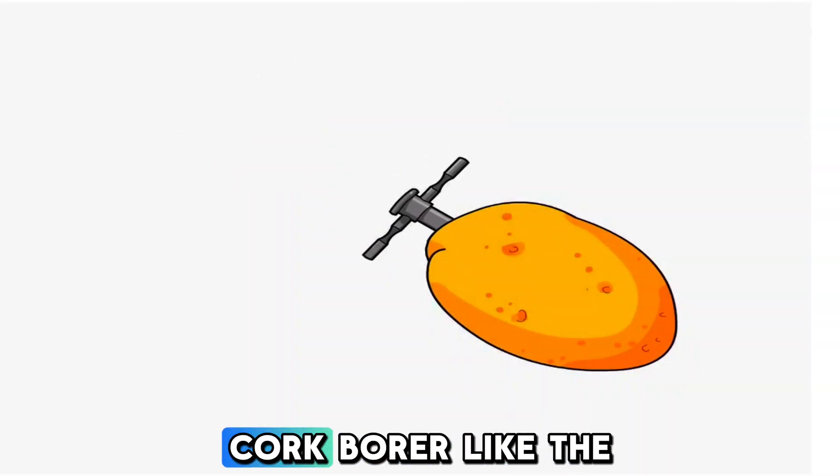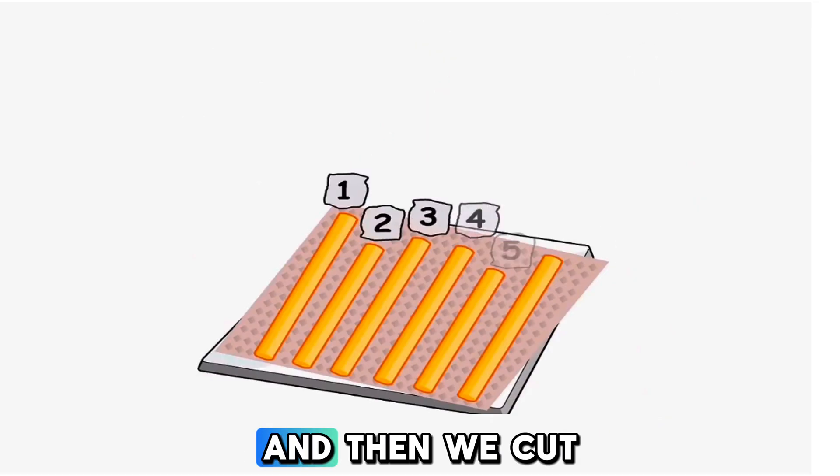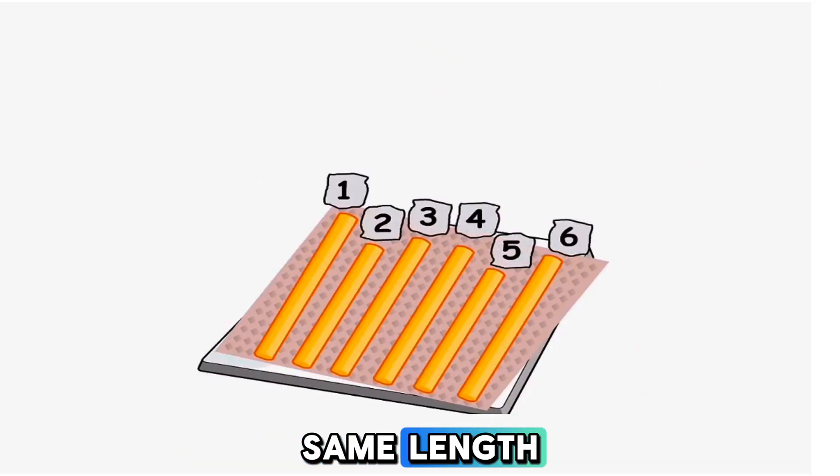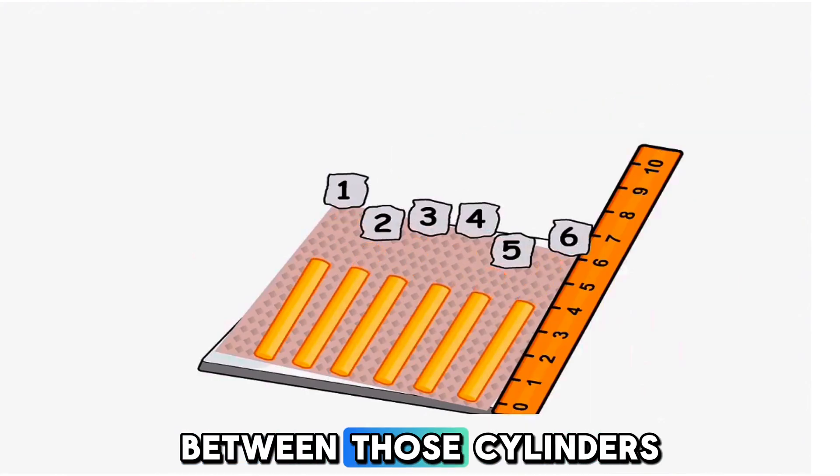We usually use a cork borer like the one you see here to form cylinders and then we cut those cylinders into the same length using a ruler so that it would be a fair comparison between those cylinders.